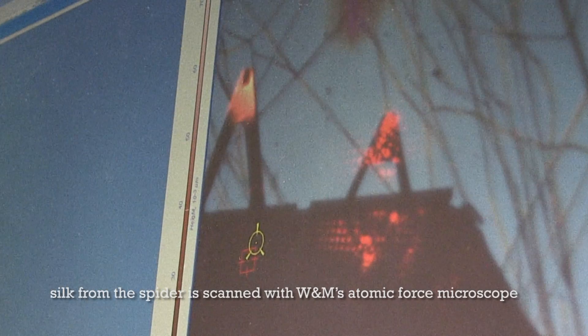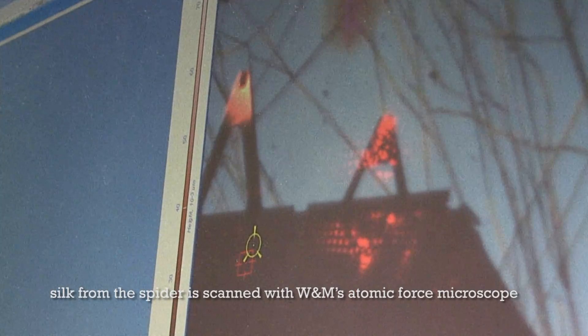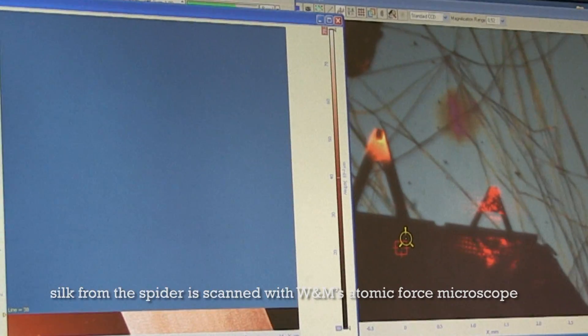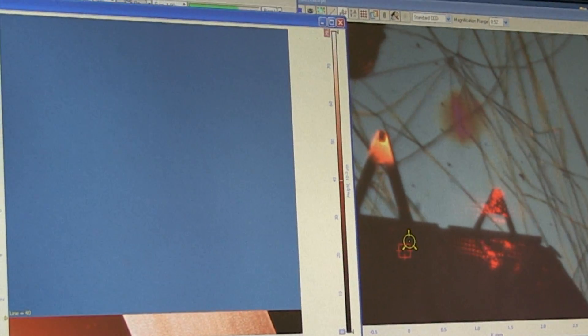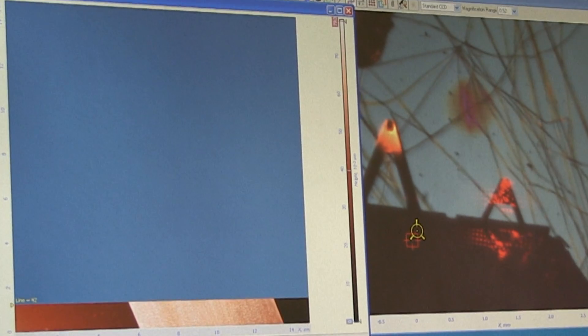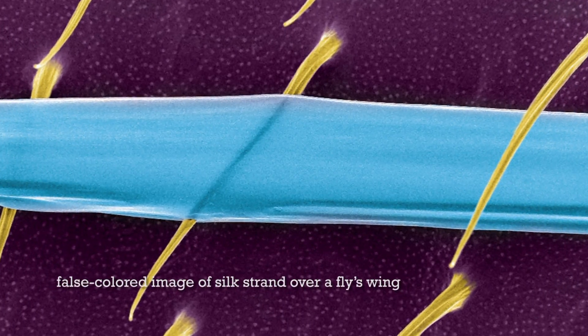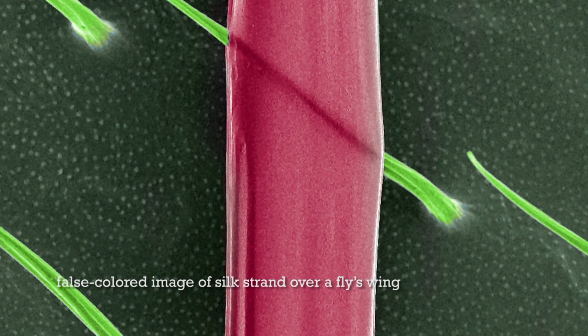Now you'll notice our scale has changed. It's up to about 80 nanometers. And we can actually see a cross-section as we're scanning. This is what the silk looks like. It's this very thin ribbon. And its height is only, looks like in this case, about 50 nanometers. 50 nanometers tall. That's only a few molecular layers of protein.